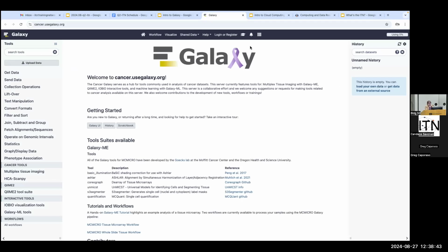But what you'll see on this top banner is login or register. If this is something that you think you're going to be using a lot, log in or register. Don't worry about it right now. The stuff Hannah's going to be doing with you do not need it right now.